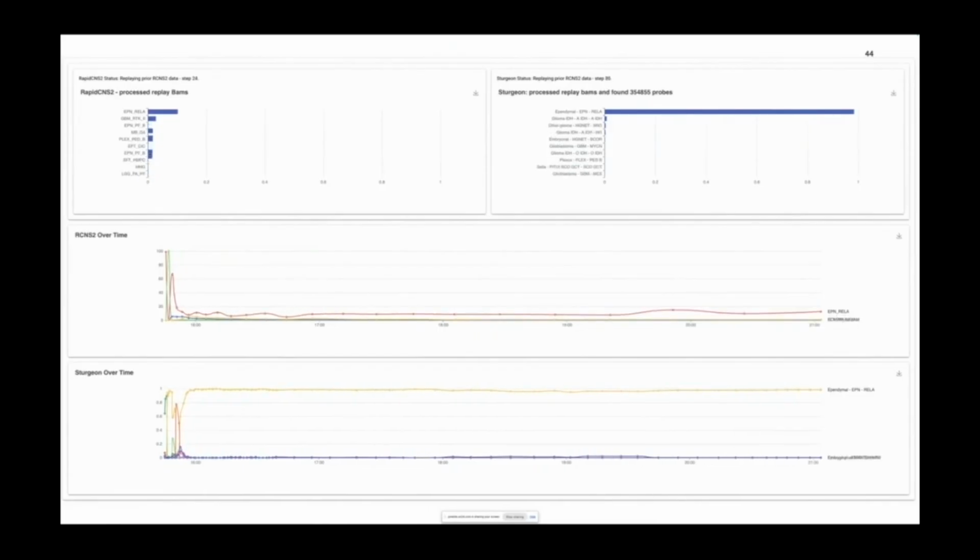And I contacted the pathologists and said, you know, this is what we're seeing. And they're 4 floors down from me in our medical school. And within about 2 minutes, there were 3 pathologists at my door wanting to see the data. And this was confirmed very, very quickly. And we knew that information. We couldn't pass it on, research use only. We couldn't pass it on at that time to the surgeons.